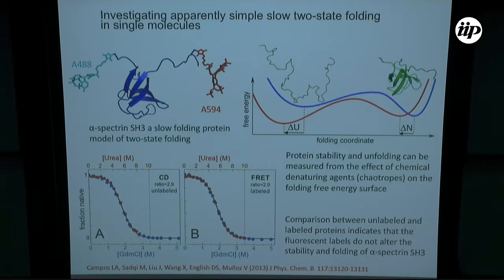So this is one of the first applications that I was mentioning before. So the idea is that if we have a surface like this, and then upon perturbation, this minima shift in position, which is something that you should expect to see in a way, you are going to be able to measure them, okay? So that's kind of the rationale of the experiment.